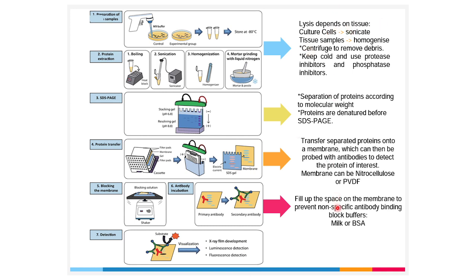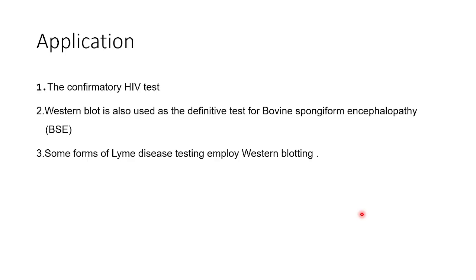So the similar protocol is also written over here, which you can follow for performing the blotting techniques. The applications of this blotting is used basically for the confirmatory HIV test.